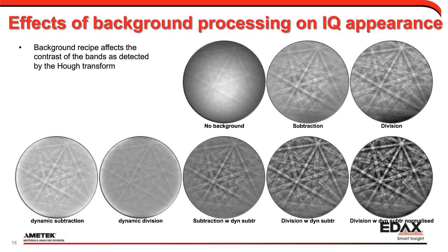It's usually not that big of an issue. There's a slight artifact in there, but if you get a strong artifact, it will affect your data pretty strongly, especially with a big grain, because then you'll be extracting or removing that pattern from that large grain. That large grain is going to misindex by itself.